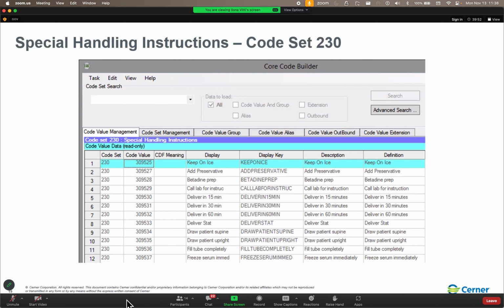This is part of the reason why I refreshed that code set before coming into colrecmate. Now, if you don't have those values in there, close colrecmate, wait a little bit, and then go back in. And actually, don't worry about it too much for this activity because we're going to have to re-add them later on.